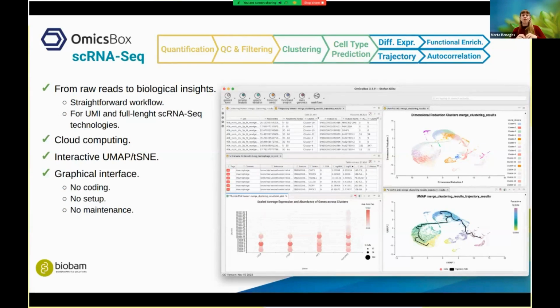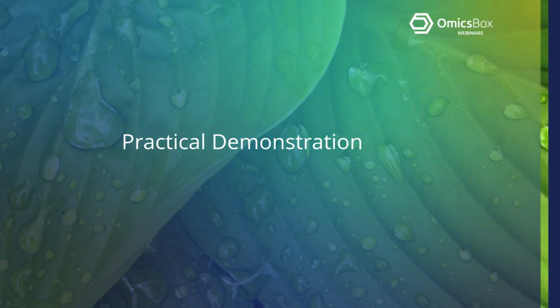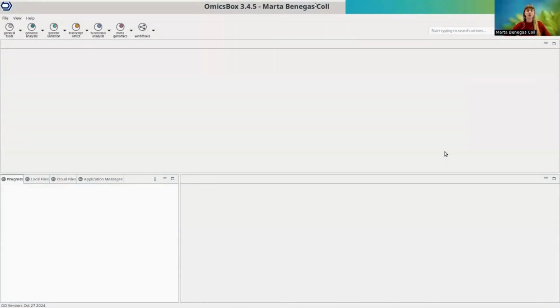And all of this can be accessed through a graphical interface. So there's no need for coding, no setup, no maintenance. Everything is simplified, so you just have to have fun analyzing your data. So let's start with the demonstration now.